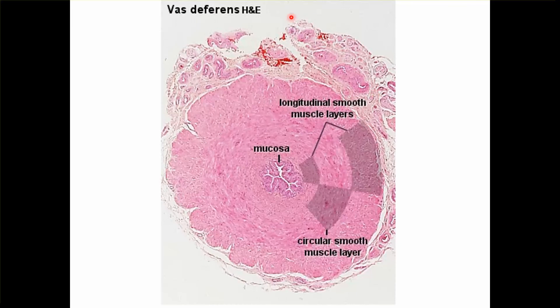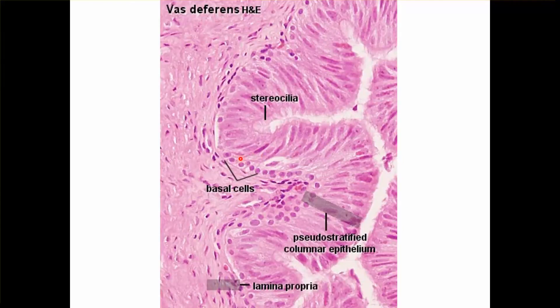Coming to vas deferens. It has a mucosa, then a muscle layer in which the inner and outer are longitudinal layers and the middle is a circular layer, and the outermost is adventitia. The epithelium is pseudostratified columnar epithelium with principal cells and basal cells, with stereocilia. You can see the lumen — it is a high-focus section.